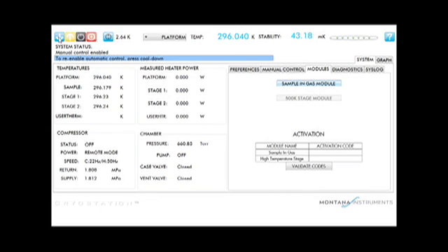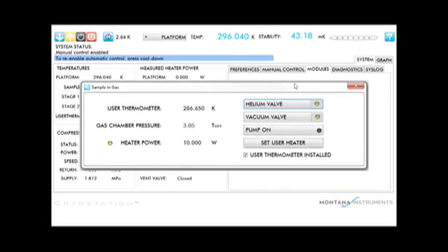The gas environment can be controlled through this gas port. The pressure will range from about 5 to 100 torr.